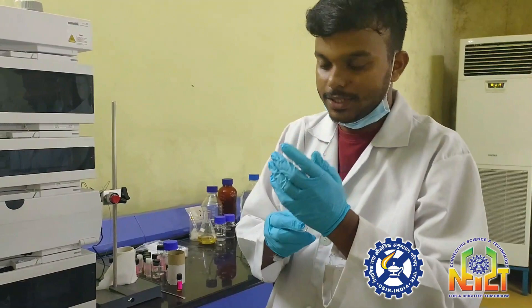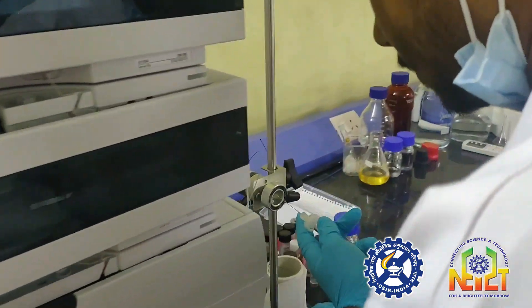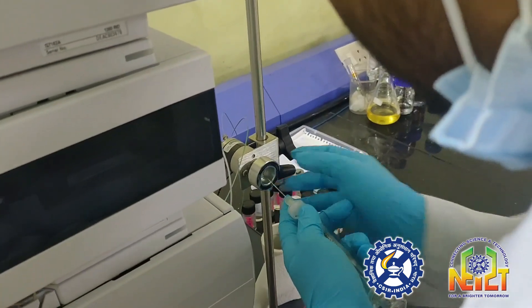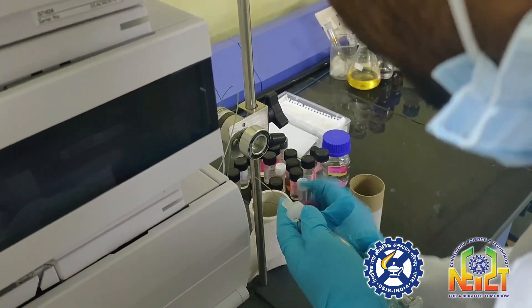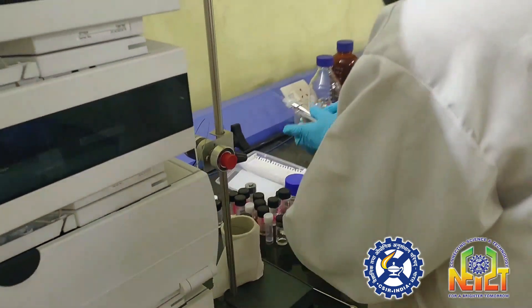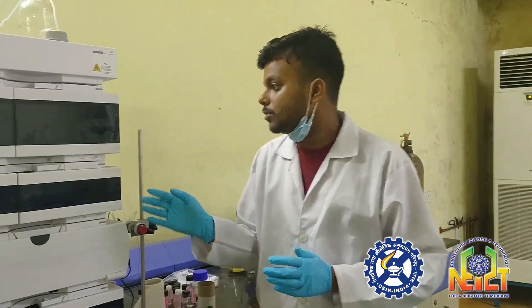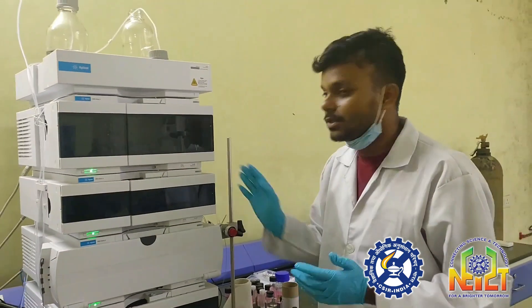We have taken the sample in this syringe and now we are going to inject it into the instrument. The sample passes through the columns from the surface of the equipment to the inside.